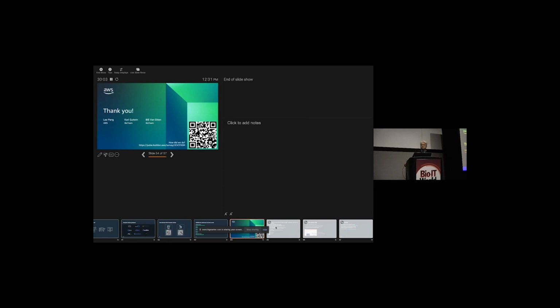One other caveat on that, Sentieon has graciously offered all AWS customers a 2-week free trial. So if you don't yet have a license, you can use it to run workflows on your account for up to 2 weeks. It's a pretty amazing offer.